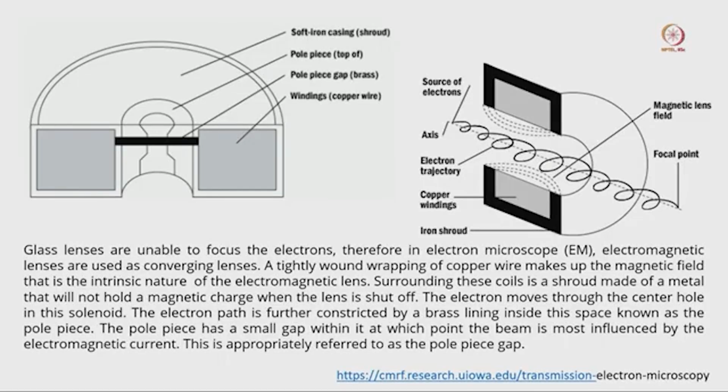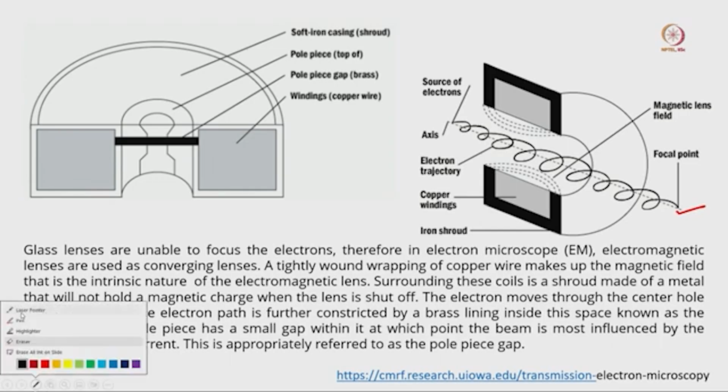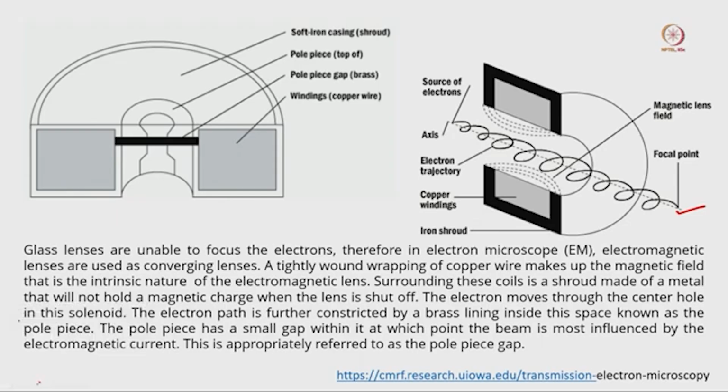Okay, so even if we are considering that there will be a motion, what kind of motion will it be? Will it be only one spiral motion? This is the optical axis we are talking about. Any ray that goes through this optical axis will have no deviation. But if there is a magnetic field, the magnetic field cannot be stopped suddenly here. It depends on what kind of lens we are using and what the magnetic field is, and it is going to affect the electron.